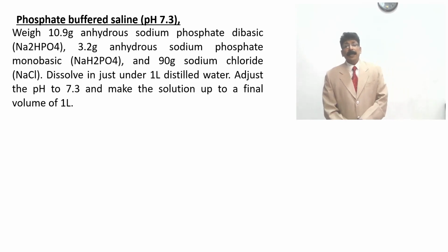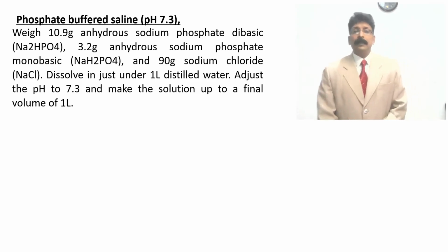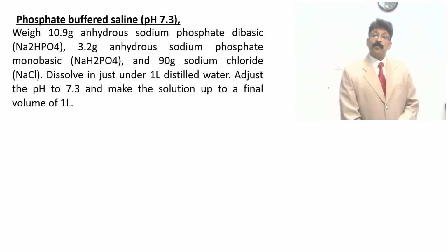Adjust the pH to 7.3 and make up to a final volume of 1 liter.